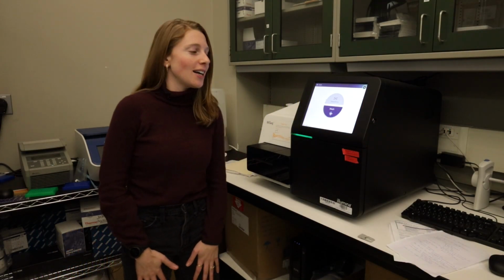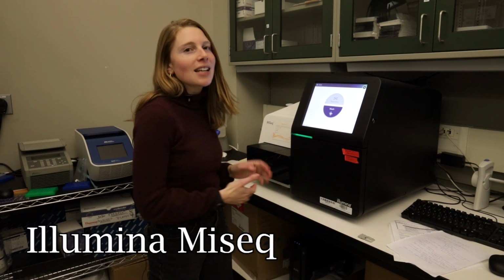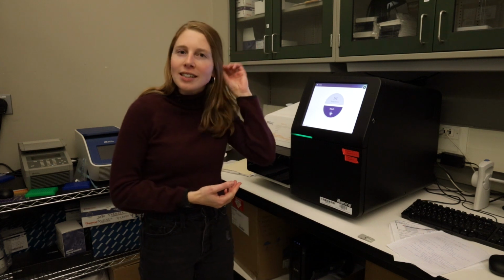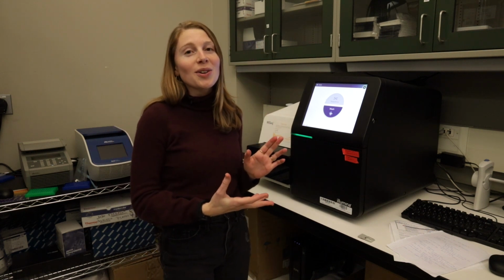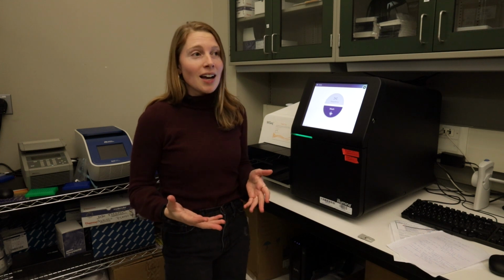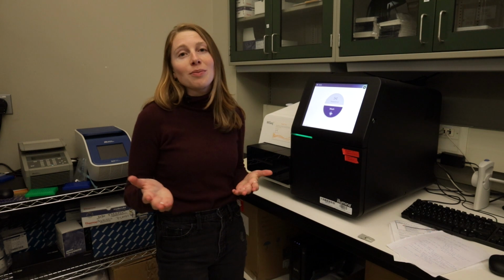I'm standing next to a more recent sequencing technology, a next generation sequencer. Here is an Illumina MiSeq. You'll notice that it's about the size of a cooler, so a little bit smaller than the Sanger sequencer. And these machines are really cool because you can do much larger genomes much quicker. And so you can sequence a human genome within a day, which is really cool.